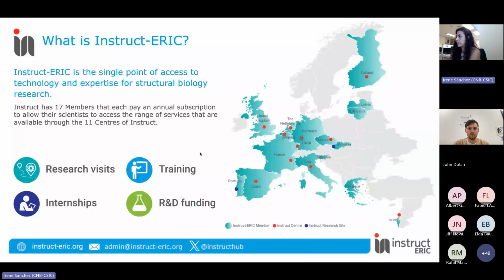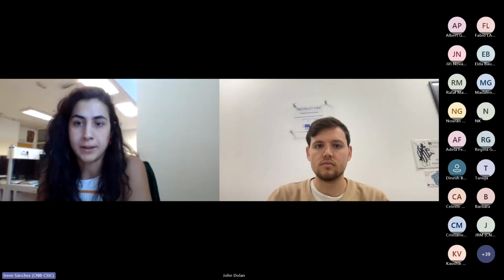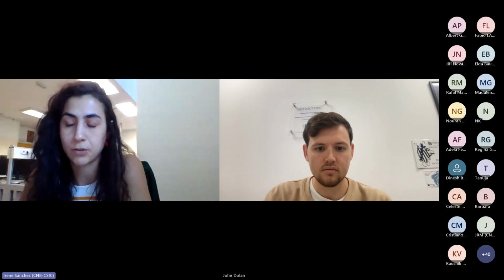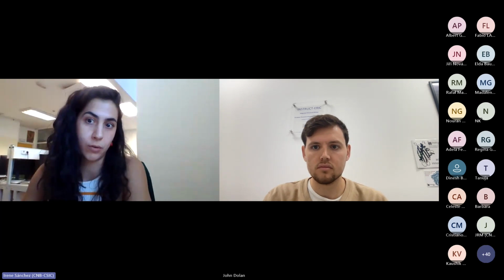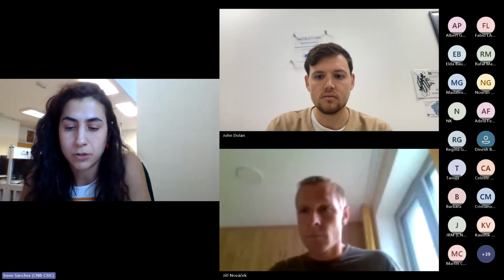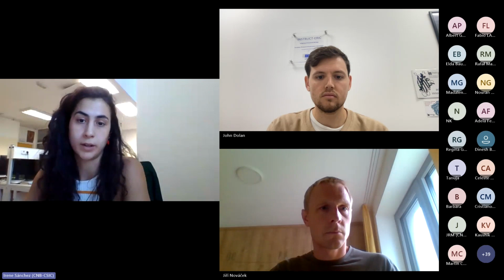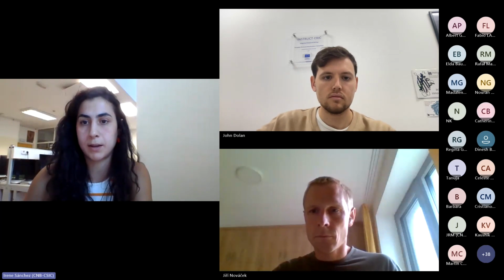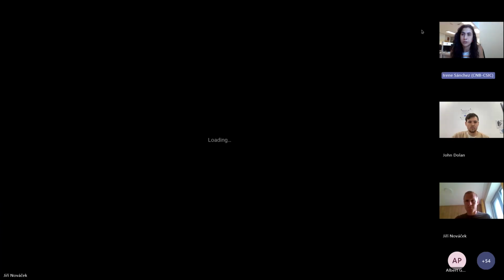So, well, let's go to the talks then. I'm gonna stop sharing. And well, our first speaker is Jiri Novacek. He's the head of the cryo electron microscopy and tomography core facility of CEITEC, another center of Instruct, placed in Brno. And he's going to give a talk on the platform for scientific data management he and his team have developed, called SIP. He will tell us about its main functionalities and how the implementation was in a mid-size Cryo-ET laboratory. So, Jirka, now you can start sharing your screen.